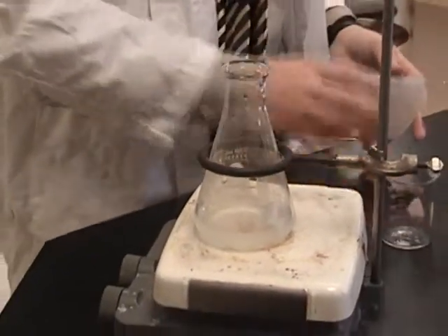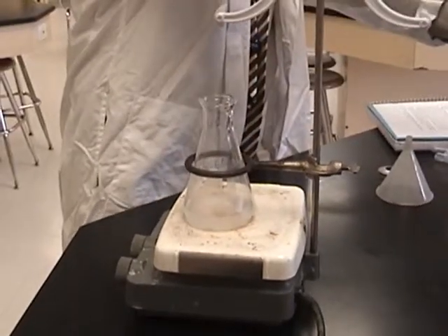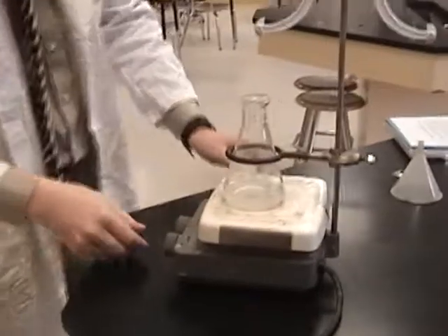In order to make sure the solution we are titrating is properly mixed, we have placed a magnetic stir bar in the beaker. Turn the knobs on your hot plate to a slow stirring speed.